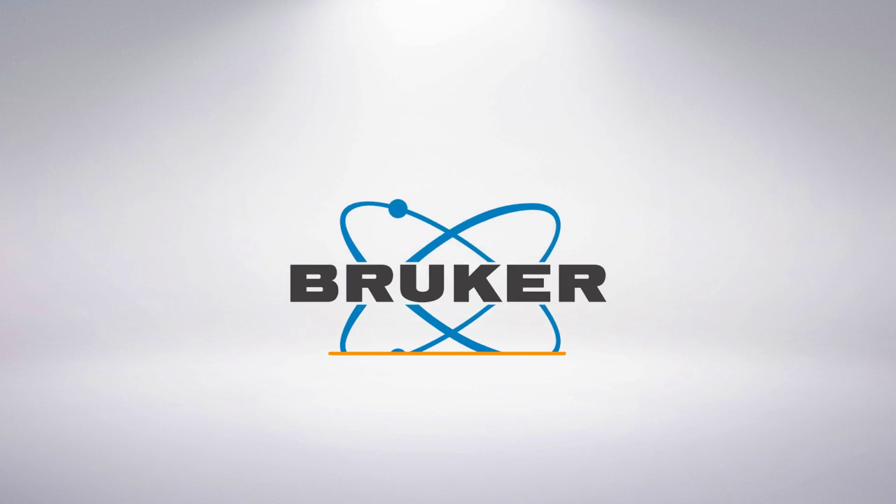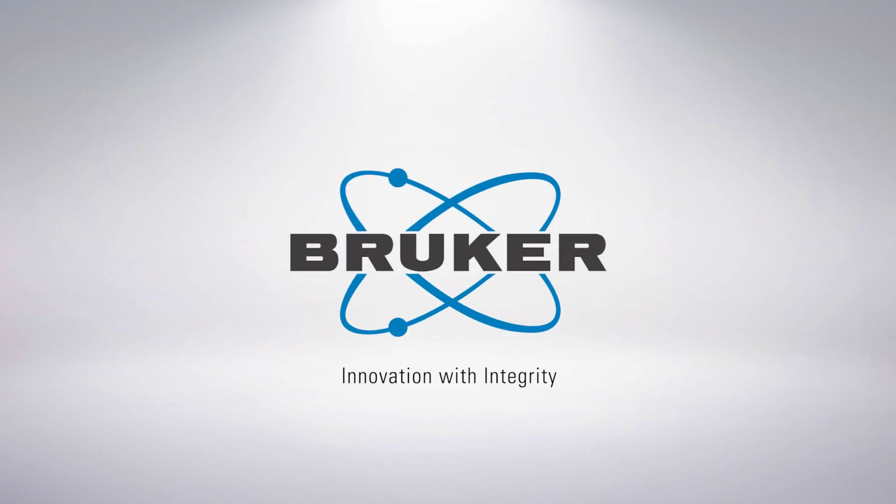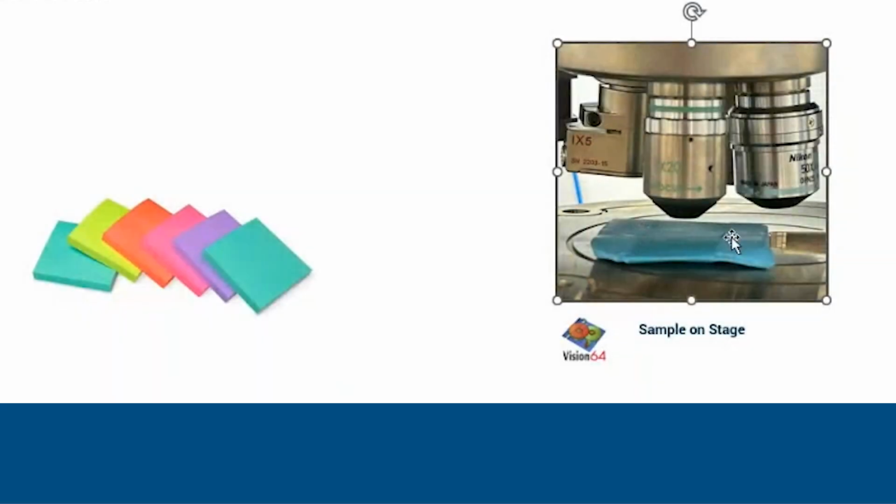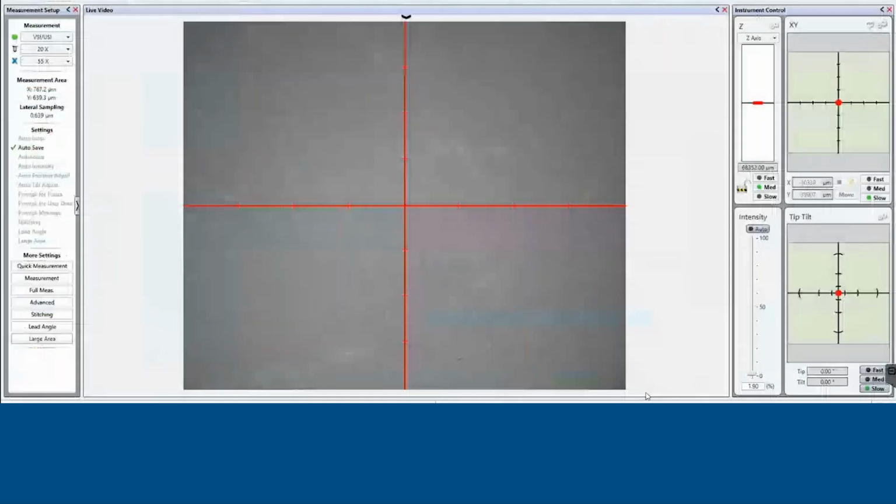So what I have right now, as I was sharing in this presentation, is this blue sticky note that I've put on top of an adhesive putty that's just kept on top of the stage. As you guys have already used the tool, you know, there's literally no sample prep that's required. You just put the part on the stage and then you bring it out and focus and then you measure.